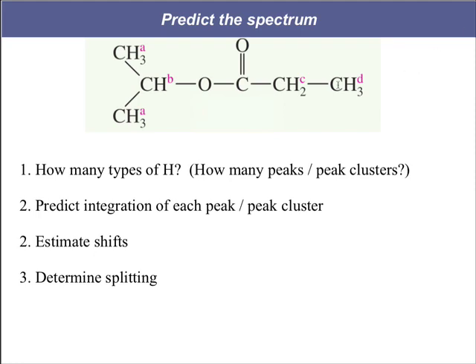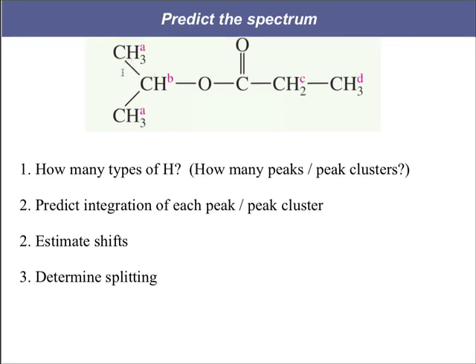Notice that we've got CH3s over here for D, and we've got CH3s over here for A. But these A CH3s are clearly different from our D CH3s. The D CH3s are on a carbon, that's on a carbon, that's on a carbonyl. These A CH3s are on a carbon, that's on a carbon, that's on an oxygen.